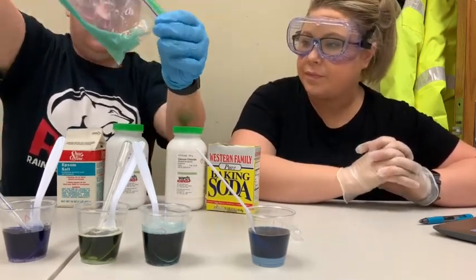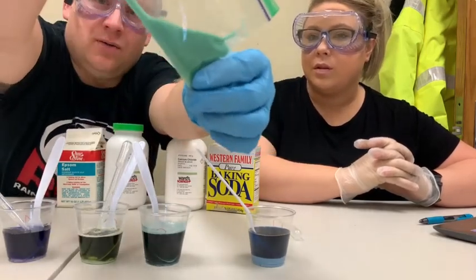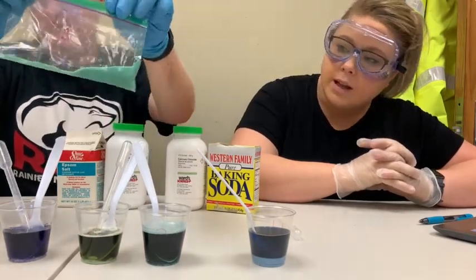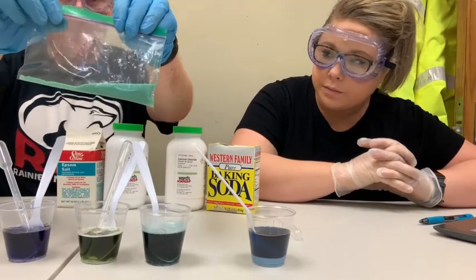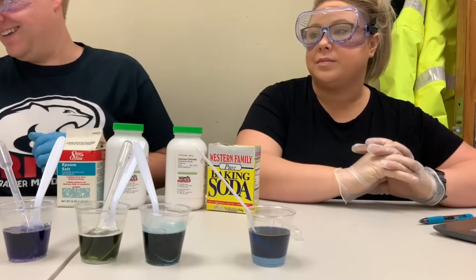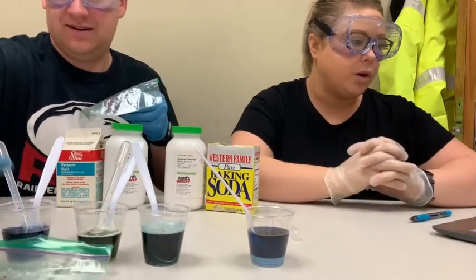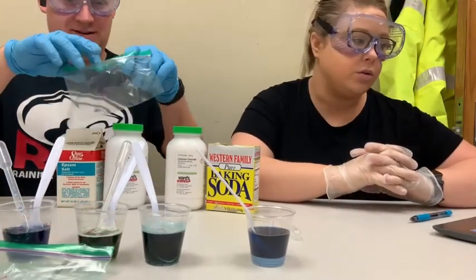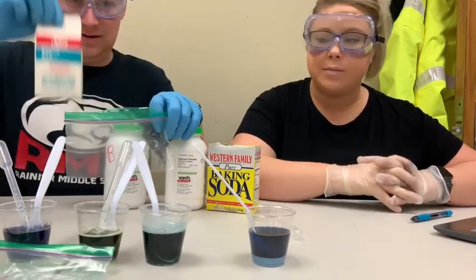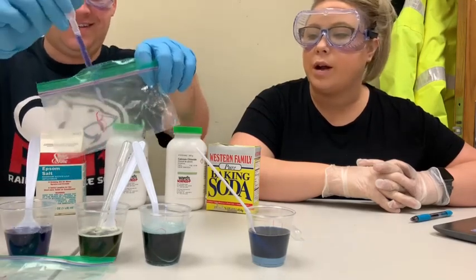All right, so we have a solid precipitate that formed at the bottom. We can kind of move the bag and you can see there's some grains that remain. And it's a little less clear, so it's more of a cloudy blue-green color. Oh yeah, we definitely had that color change. All right, so what's the next one? Okay, step 2, in bag B, we are going to use the same procedure. So 3 droppers full from a pipette of magnesium sulfate and calcium chloride.